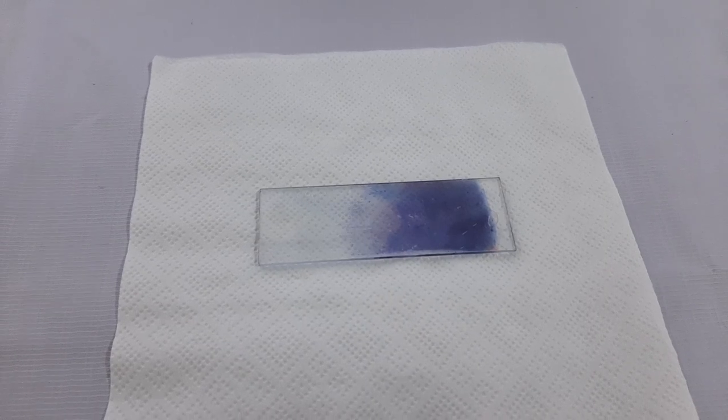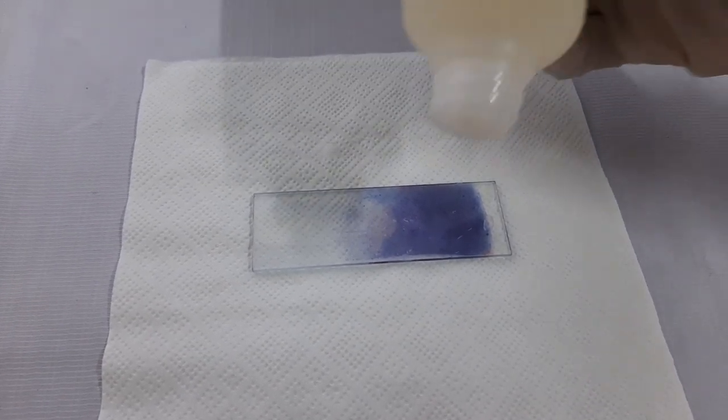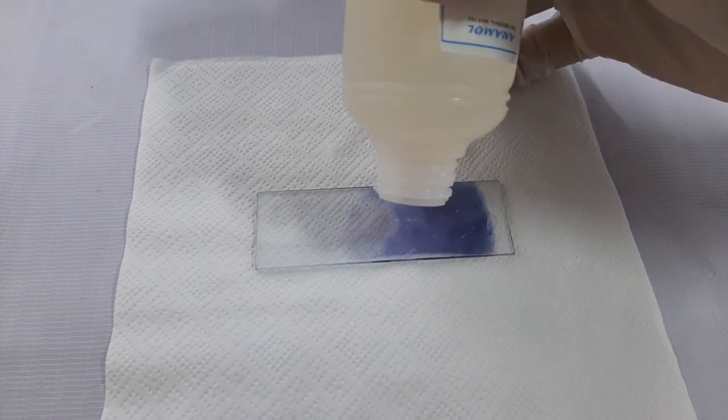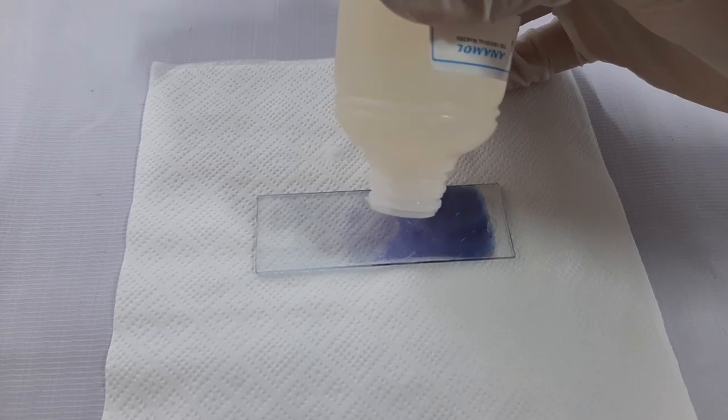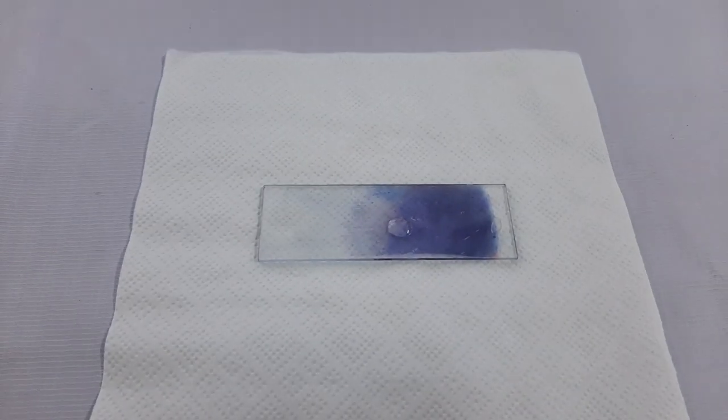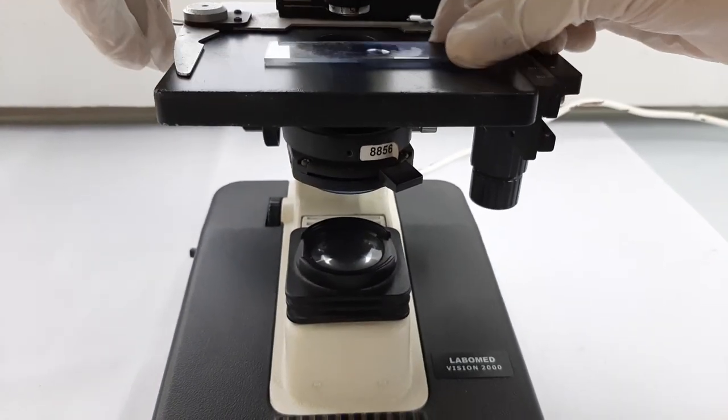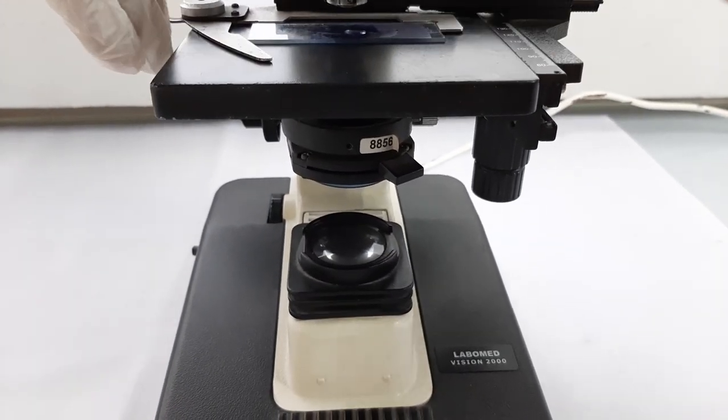Once the slide is air dried, place one drop of immersion oil on the thin side of the film. And place the slide under the oil immersion lens of the microscope and observe for further examinations.